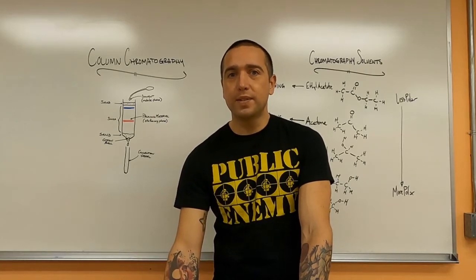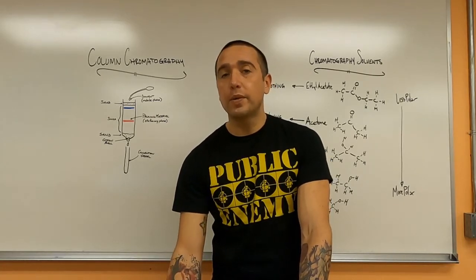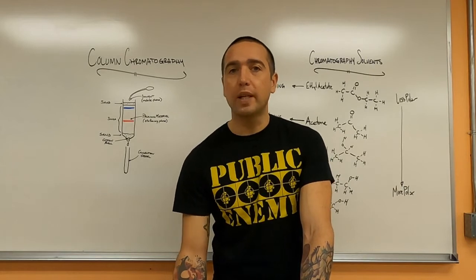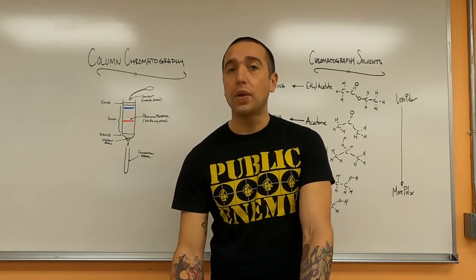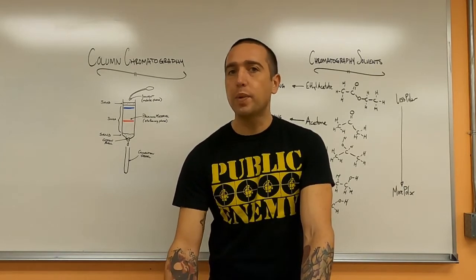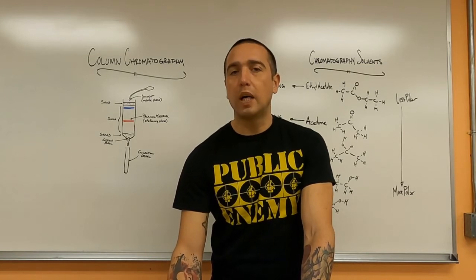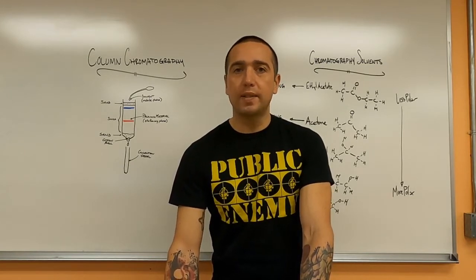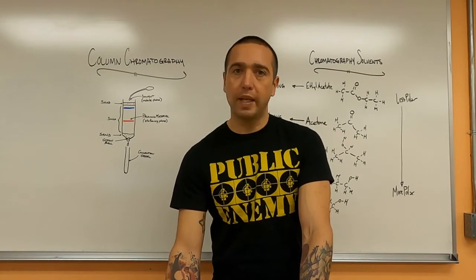Hey, welcome back future scientists. Today I'll be showing you how to separate a mixture of dyes using column chromatography. This is part three of four for our lab on identifying and separating the mixture of food coloring dyes.